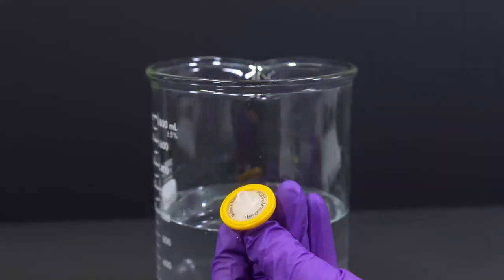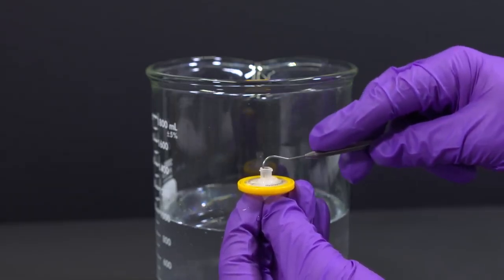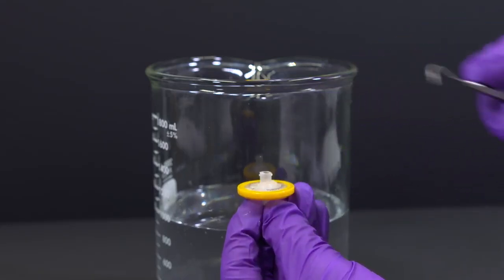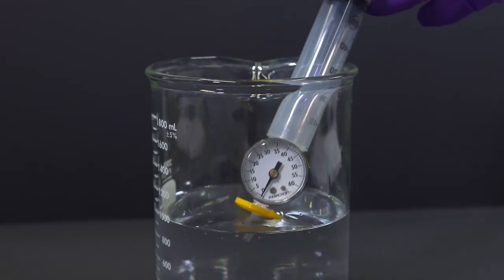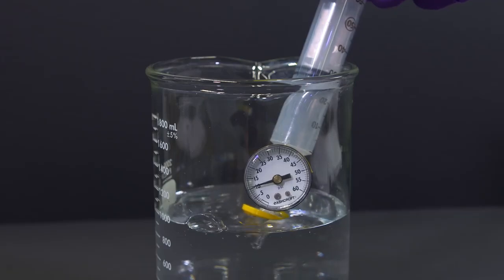Bubble point not only gives us a correlation to retention, but it's also a way to identify membrane defects. If I put a hole in my 0.22 micron filter and repeat the bubble point test, I can push air through very easily. The difference between an intact filter and a damaged filter is very clear.